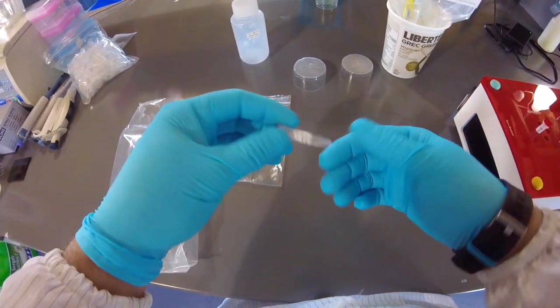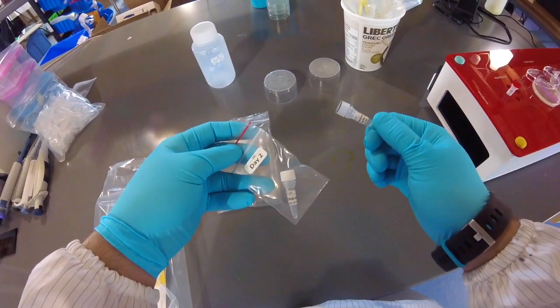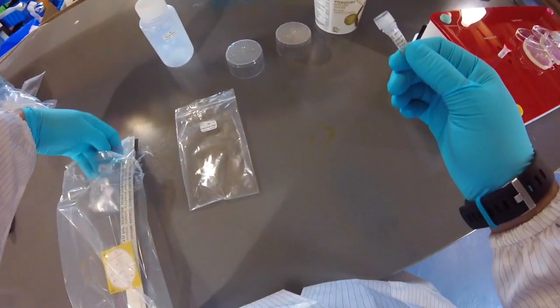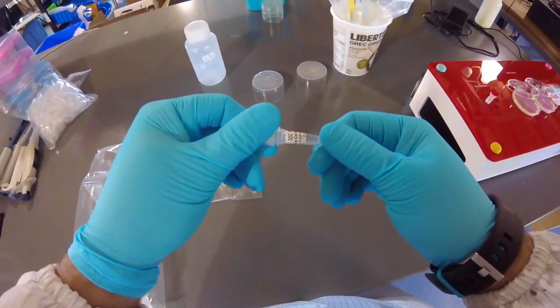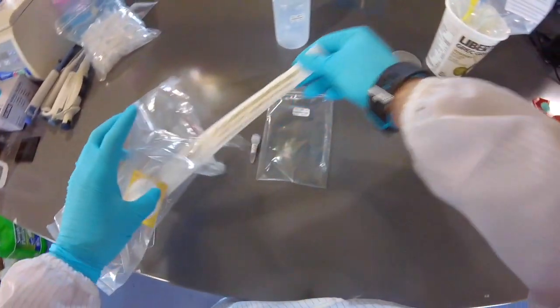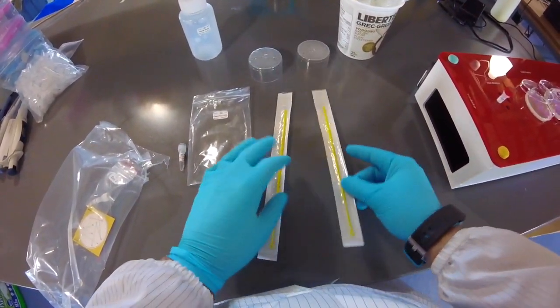They should be colored. And while the DNA plasmids you got may not produce the exact same color as the positive control, it's more or less you need to consider how the cells grow, what they look like, and do they create a color. Okay, so let's just set that down here. We're going to need 2 loops. Again, 1 for streaking your engineered cells on the Petri dishes, and then 1 for doing the positive control.